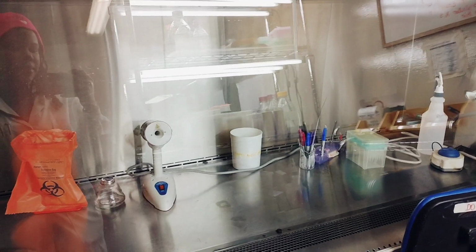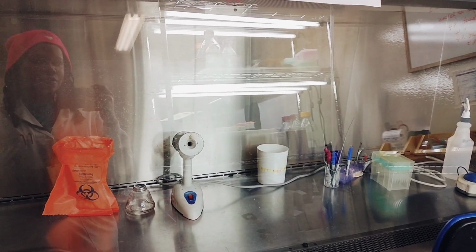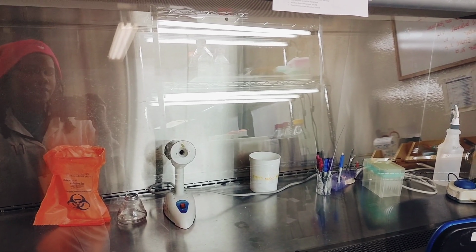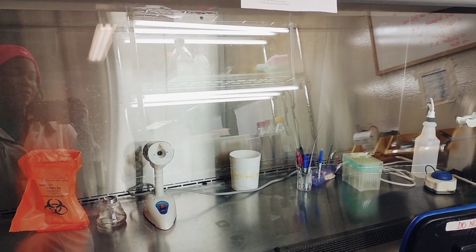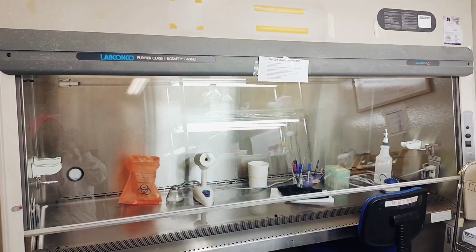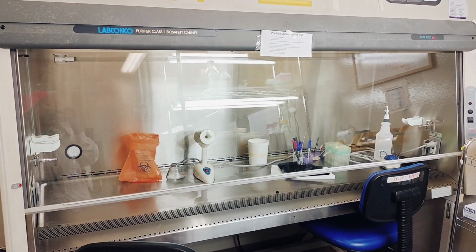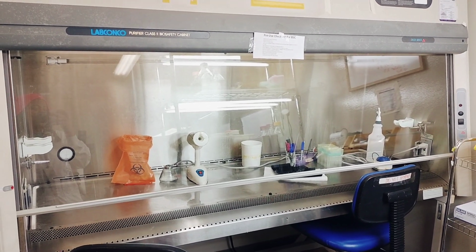Because I'll be using the BSC to prepare the inoculum, what I like to do is to get it up and running, because it's going to take a while, maybe 15 minutes, to do the sterilization of the BSC. So I'm going to do that before I do anything else. It's doing its thing, so the room is about to be really loud. But anyway, while that's happening, I'm going to go gather some things I need.